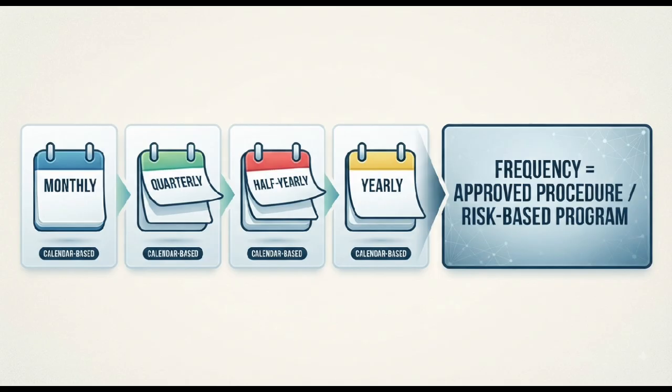Calibration frequency. How frequently should an HPLC be calibrated? There is no single frequency that applies to every laboratory and every HPLC system. The frequency should be established through the laboratory approved calibration program, manufacturer recommendation, applicable requirements, equipment history, risk assessment, and intended use. Many laboratories have predefined periodic calibration intervals, but the actual frequency must be determined by the applicable quality system. Always follow your approved SOP.